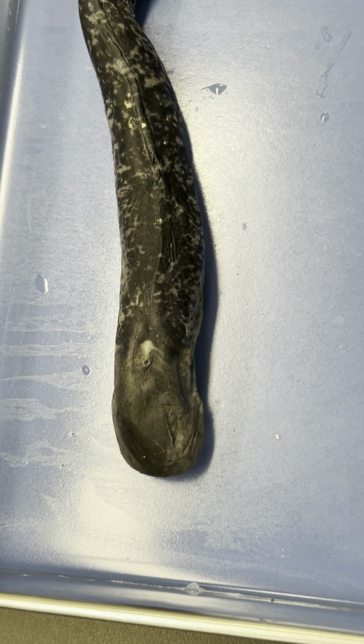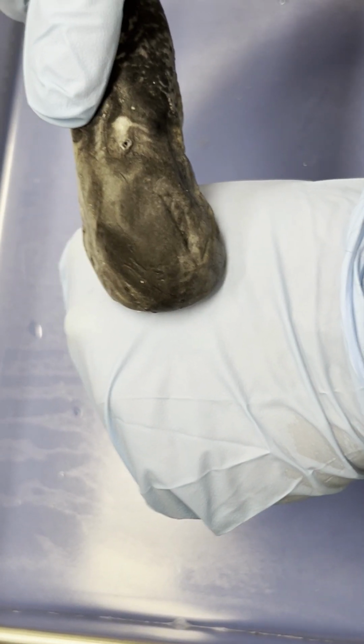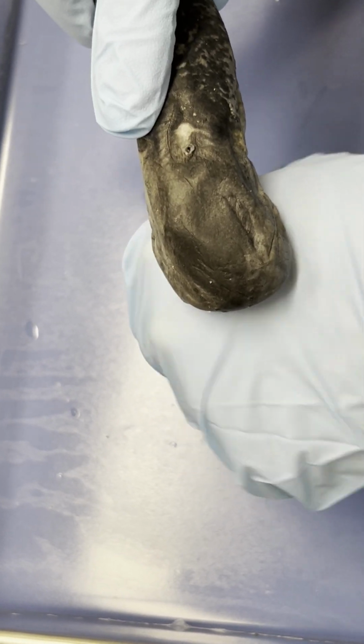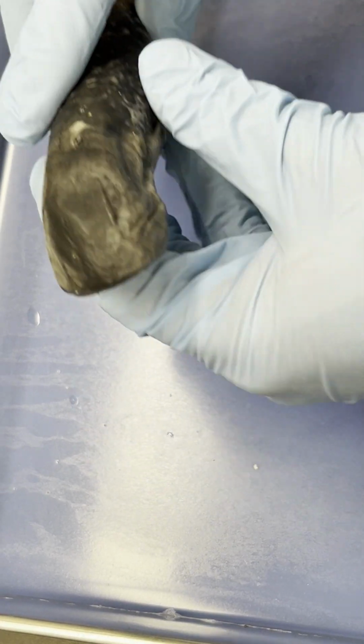The first one are filter feeders. So lampreys will actually take their buccal cavity right here and latch onto a rock just like that. And then they're just going to filter feed with the microorganisms that's in the water column. We also have flesh eaters, quote unquote, of lampreys. They do the same thing.